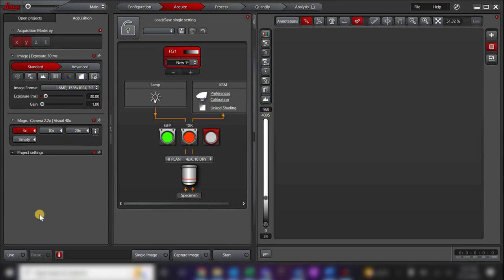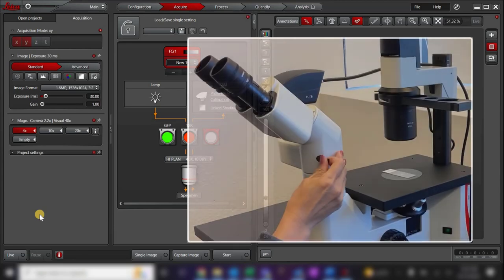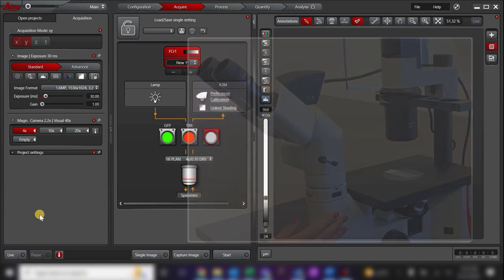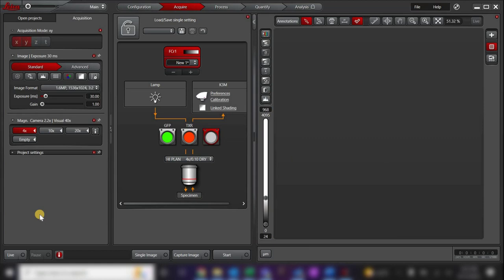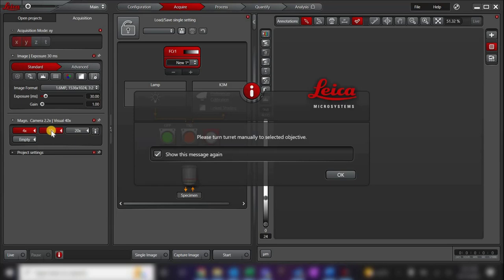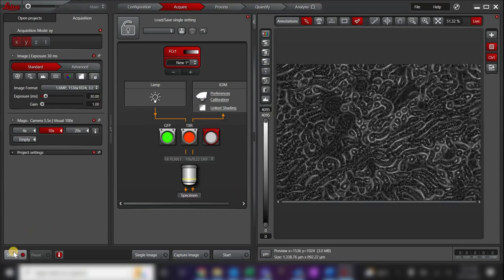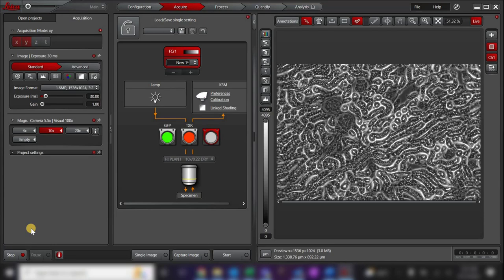Let's start by going over how to take a transmitted light image of your sample. First, check that you are sending the light from your sample to the camera by pulling out the lever below the eyepieces. Next, select the objective you wish to use from your Objectives menu. Manually move the correct objective into place and click OK. When you are ready to view your sample, press Live. This will give you a live preview of your sample. You can use this preview to adjust the focus or illumination settings before taking your image.